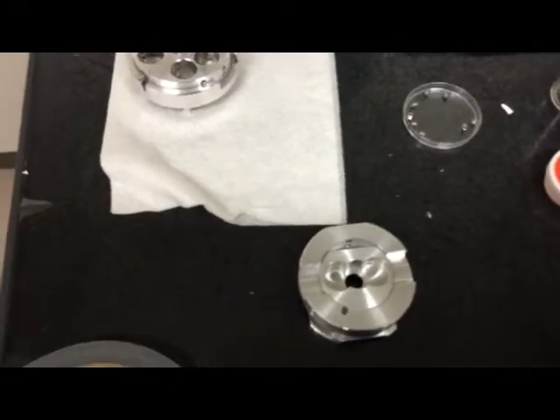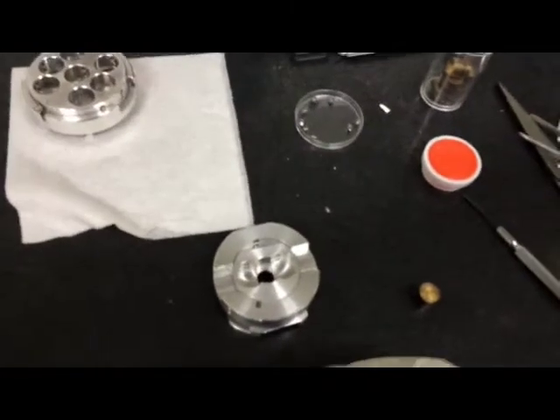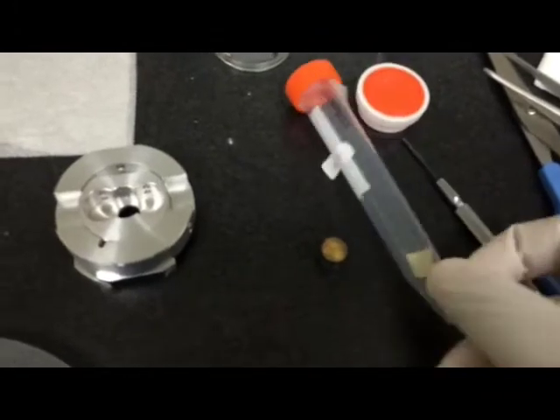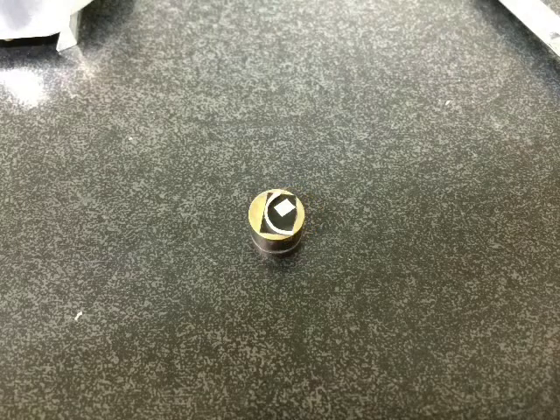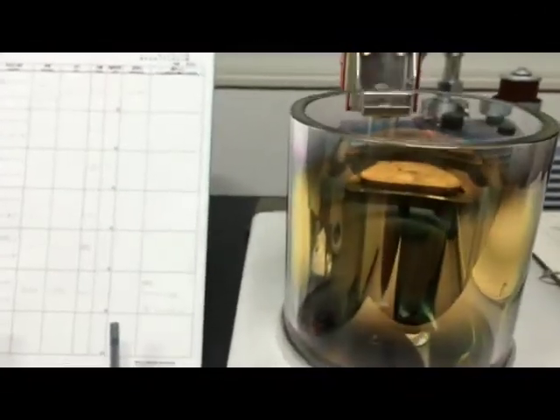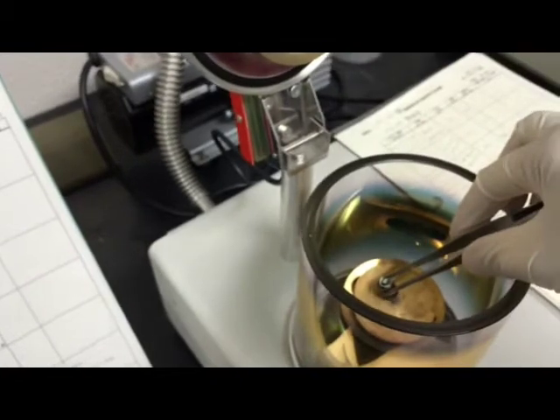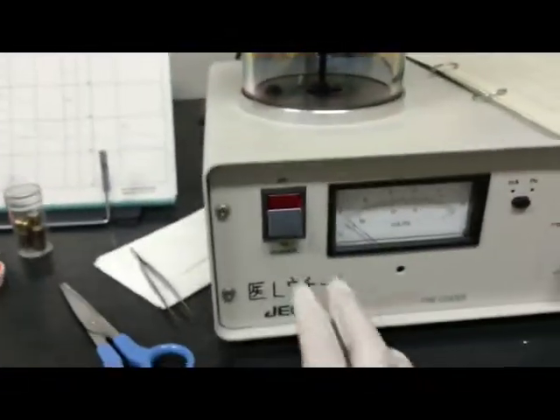You can use this one, but now I want to use this one. We need one here. Put the tip in here, and also place my sample. Now it's coating with the gold — open this one, it's simple. Place the sample in the center and close it, then start.